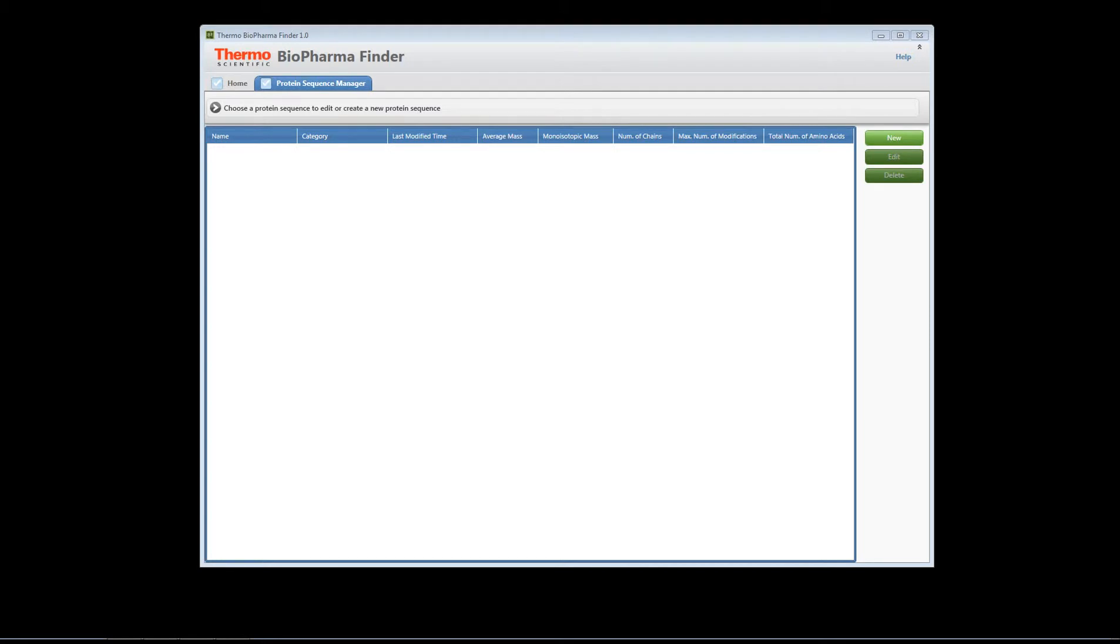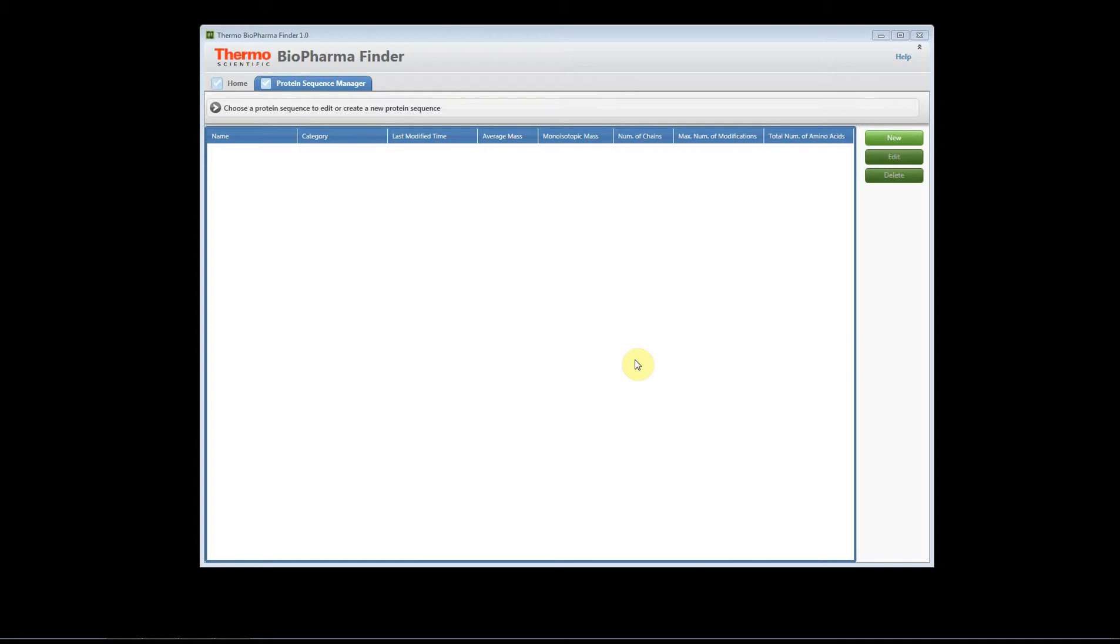Welcome to the help videos for BiopPharma Finder. In this video, I'm going to show you how to load a protein sequence for an intact analysis in which we want to connect the disulfide bonds. In this example, we're going to look at an antibody and we need to connect the disulfide bonds. This is an intact analysis of the antibody.